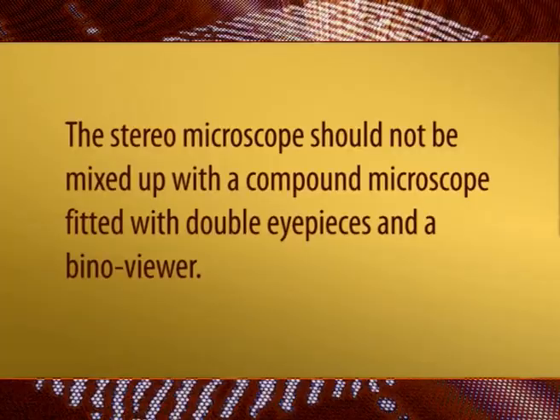The stereo microscope is frequently used to analyze the surfaces of solid specimens or to carry out close work such as sorting, dissection, microsurgery, watchmaking, small circuit board manufacture or inspection, etc.